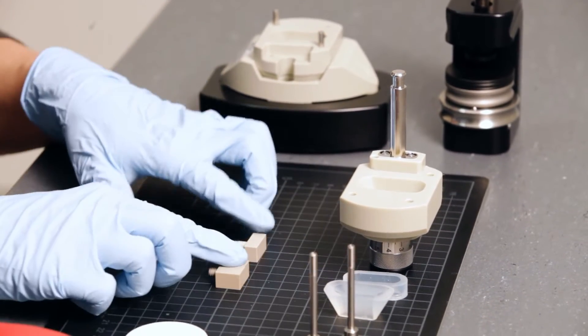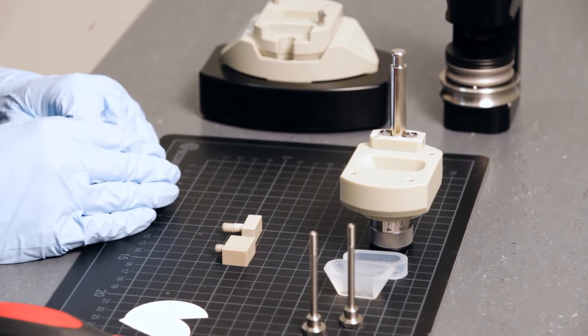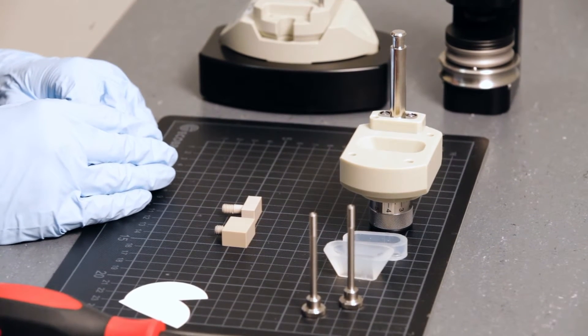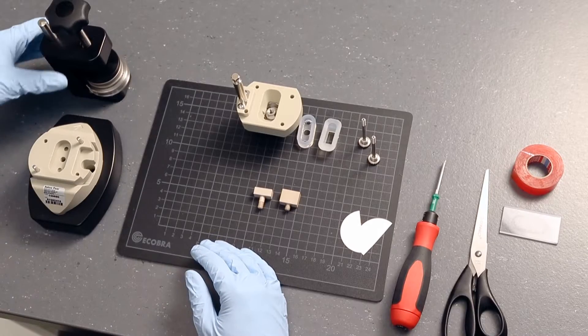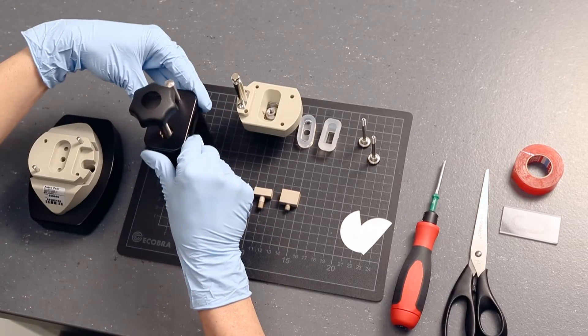Note the different heights of the respective sample holders. Make sure you don't switch them. Use the punching tool to mount the sample onto the sample holders.